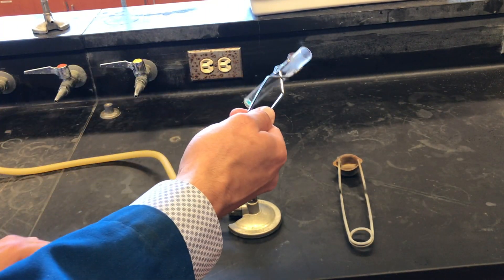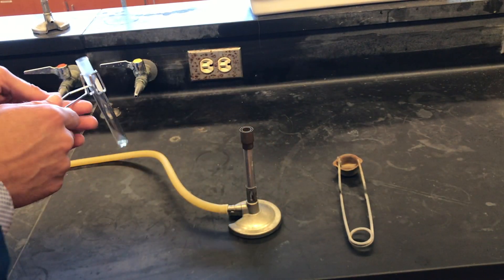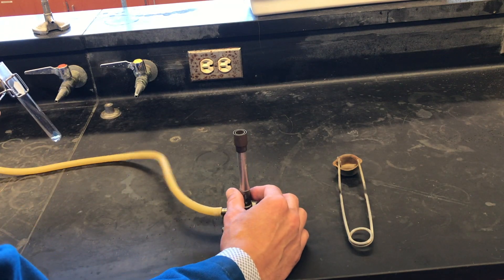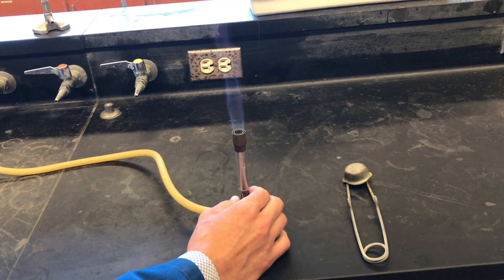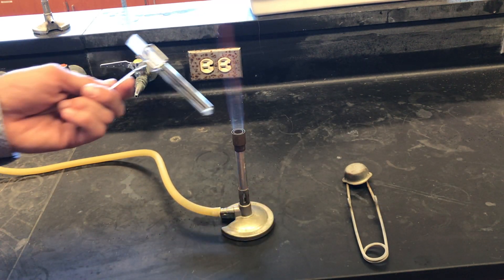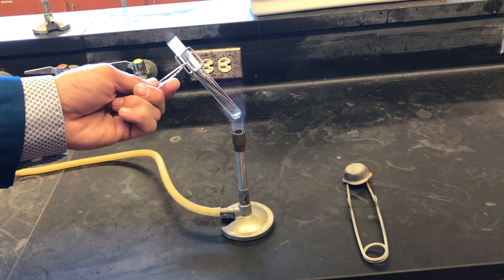If accidentally the Bunsen burner goes out, turn off the natural gas, close the oxygen valve, then turn the gas back on and relight the Bunsen burner. Then again, appropriately open the oxygen valve until there's no orange in the flame and continue your experiment.